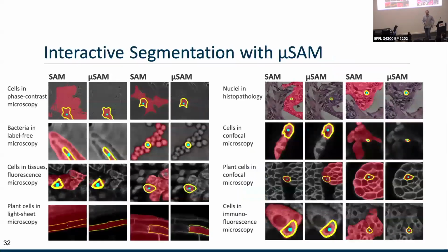Yes, please. Question: what is the typical part for fiber? For fibers, the main problem is that these structures are so small and filamentous, and these models are not very good at details. This is related to the architecture design.